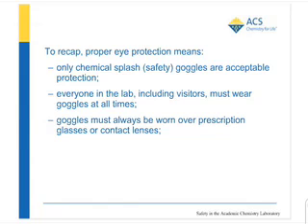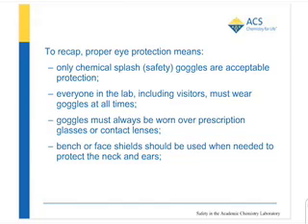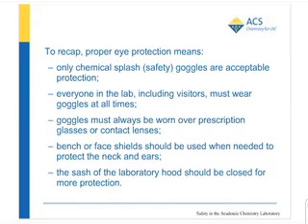If you're wearing prescription glasses or contact lenses, wear goggles over them. This is particularly important in the case of contact lenses, which can trap chemicals and keep them in intimate contact with the eyes. Use bench or face shields when needed to protect the neck and ears. Close the sash of the laboratory hood for additional protection.